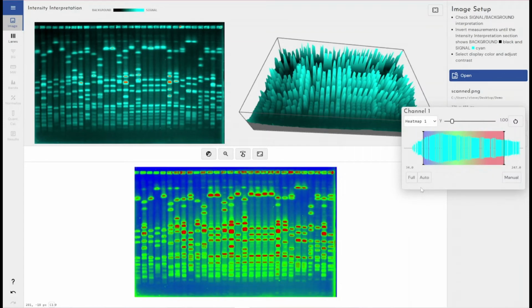So this kind of thermal vision Predator type view. This is really good at finding faint bands within your image, because it colors your bands this bright green color, the bright red color, and the bright blue color. There's a huge contrast between those different colors, and it allows the human eye to pick out very faint signals that might otherwise be lost in your standard grayscale image.